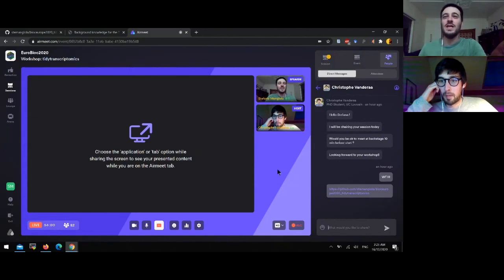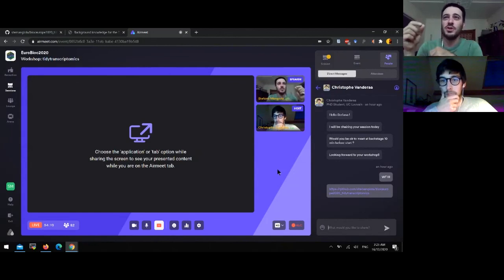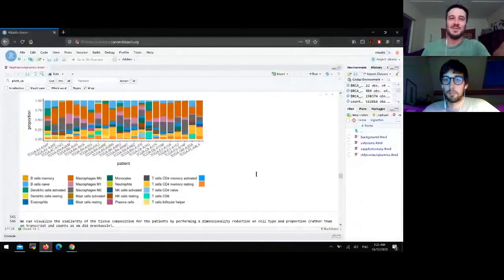I will research how PCA handles it. First of all, you could avoid calculating PCA on straight proportions and instead apply a logit transformation to transform proportions into unconstrained space. This could help, but still the components will be correlated. Nonetheless, an interesting question.